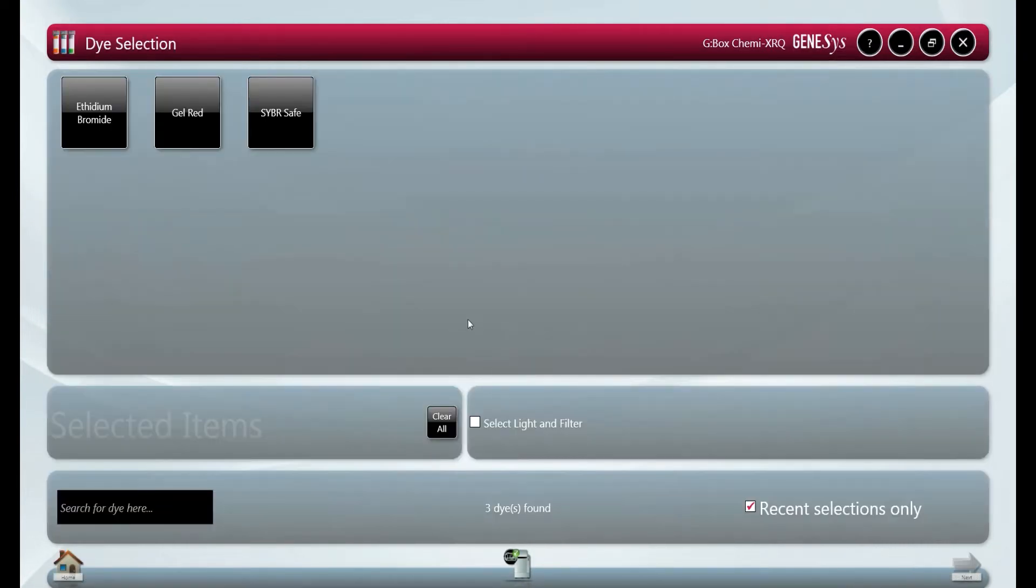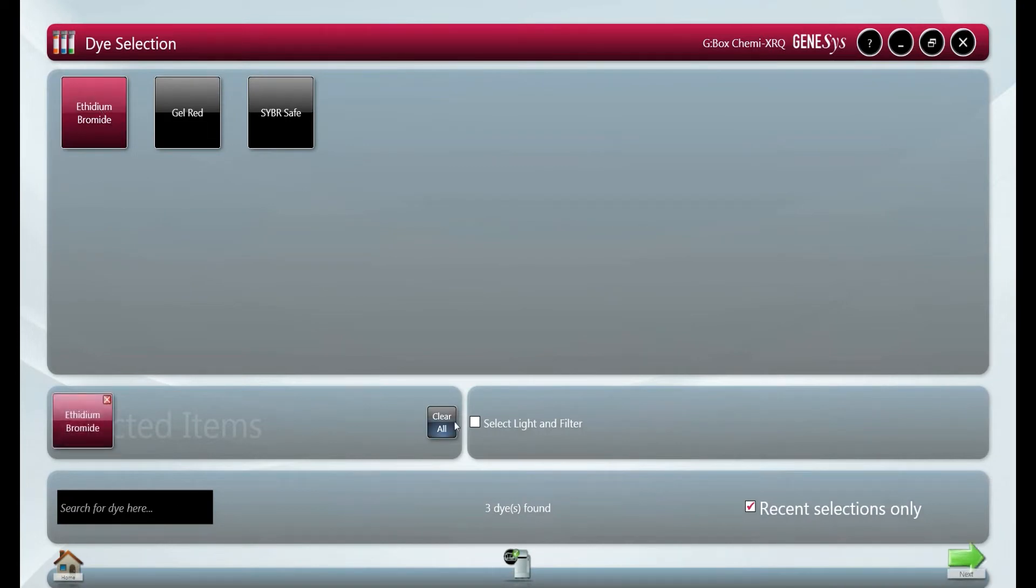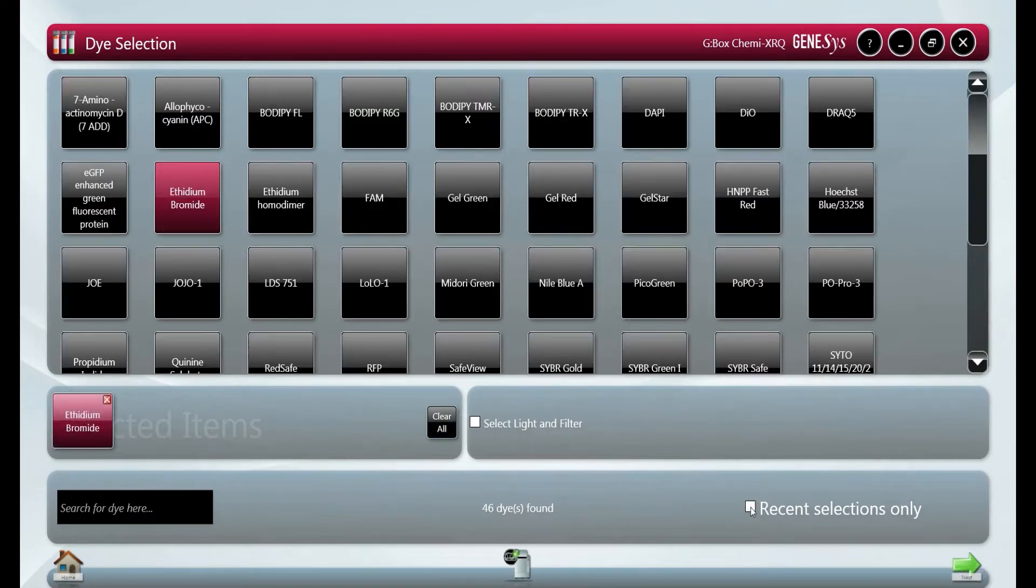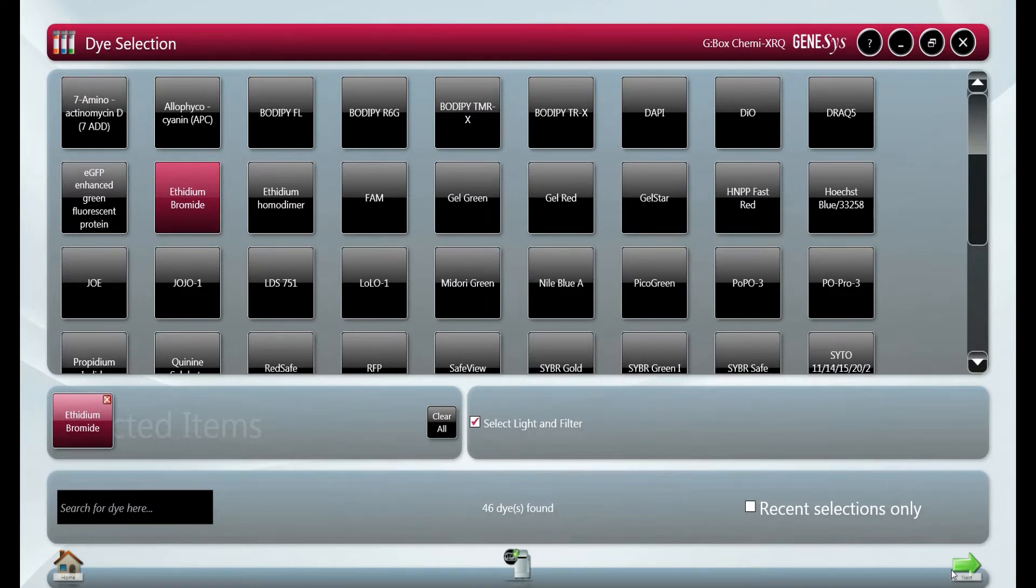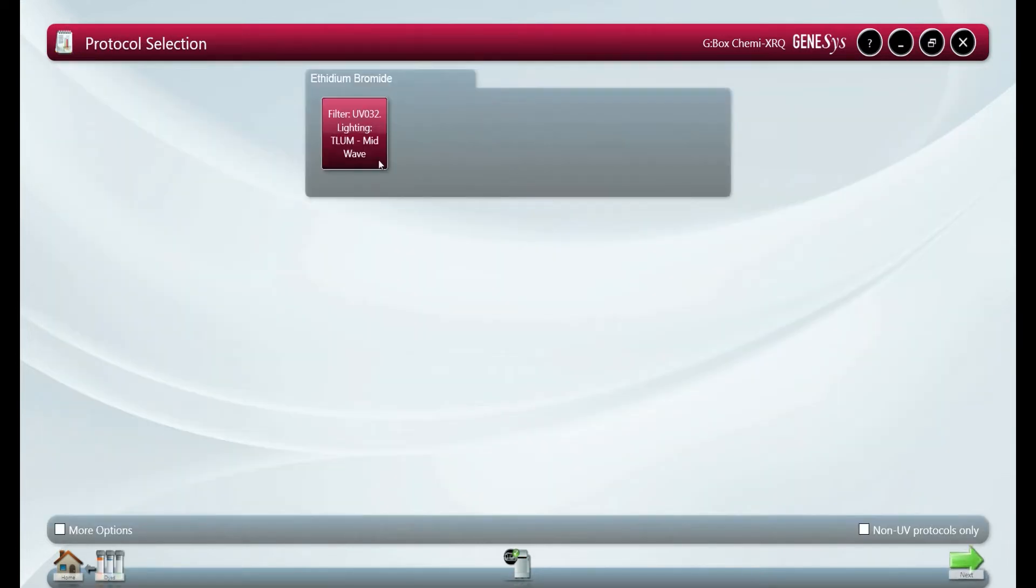The next step is dye selection. This will bring up a recent selection of dyes used or you can select the full library within Genesis which totals over 300 dyes. We also have the option to change the lighting and filter selection for the dyes.